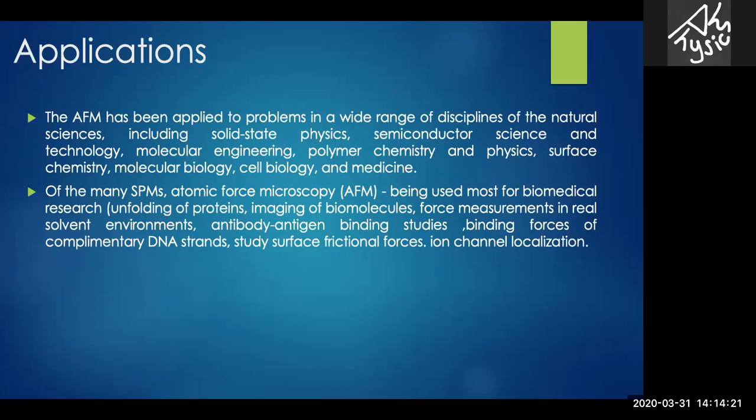In molecular biology, the atomic force microscope can be used to study the structure and mechanical properties of protein complexes and assemblies. For example, AFM has been used to image microtubules and measure their stiffness.